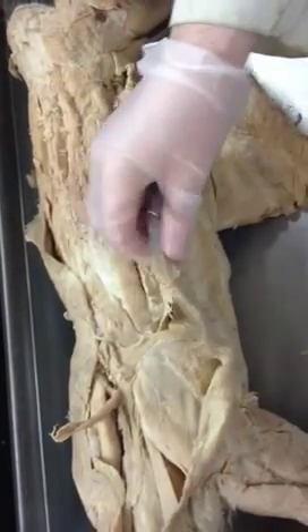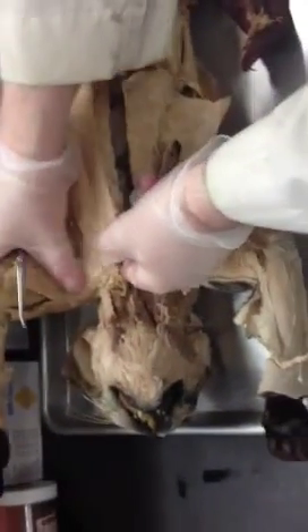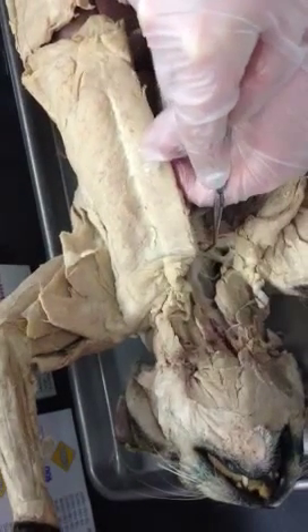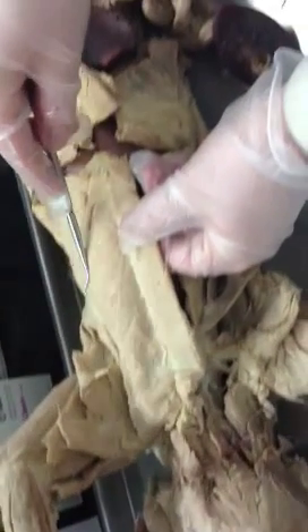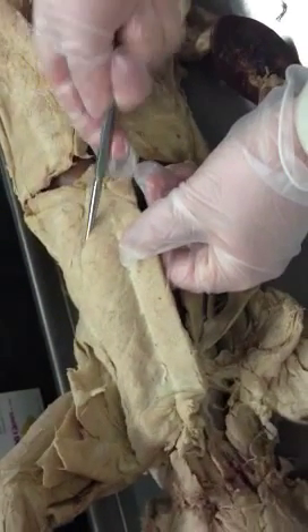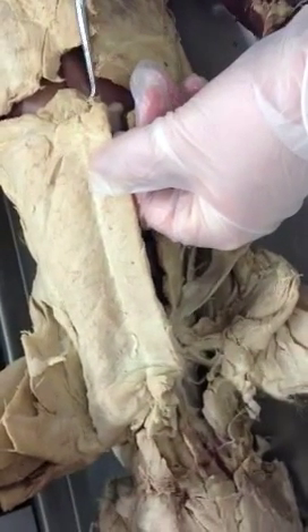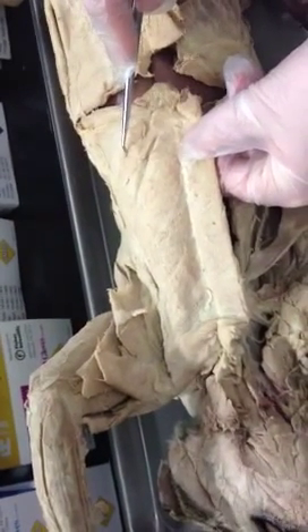Then we move to the thoracic muscles. This cat is pretty good for those. There are four strips of muscle on the pectoral region. Number one is the pectoantibrachialis, number two is the pectoralis major, number three is the pectoralis minor, and you can see there's a split here. The fourth strip of muscle goes from the xiphoid process of the sternum to the humerus — that's called the xiphoid humeralis.